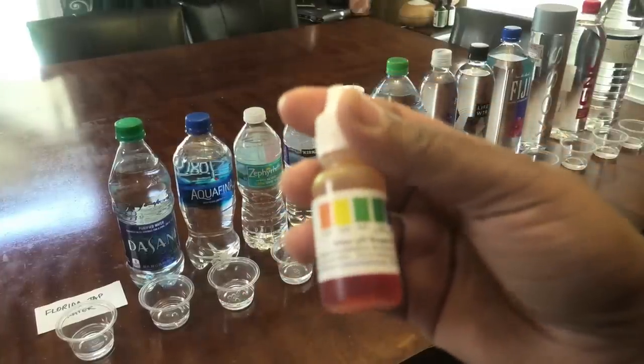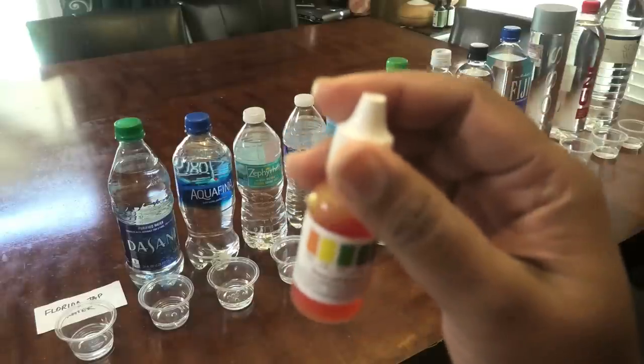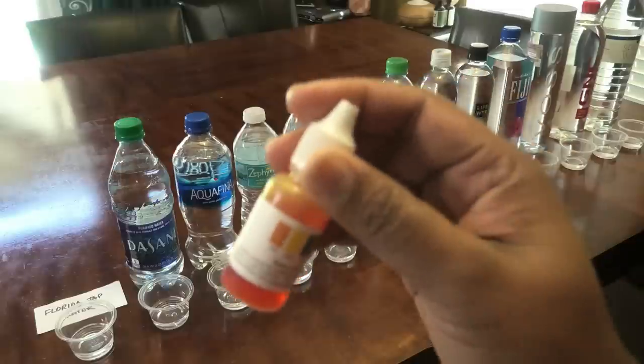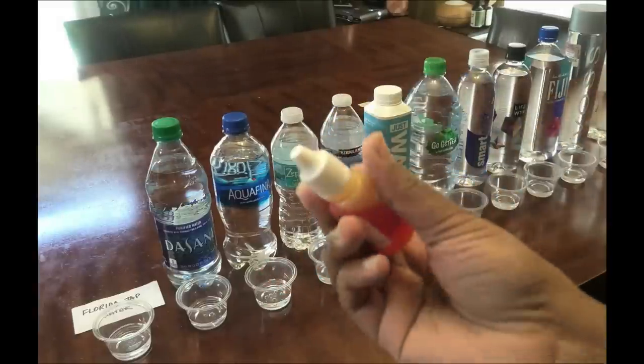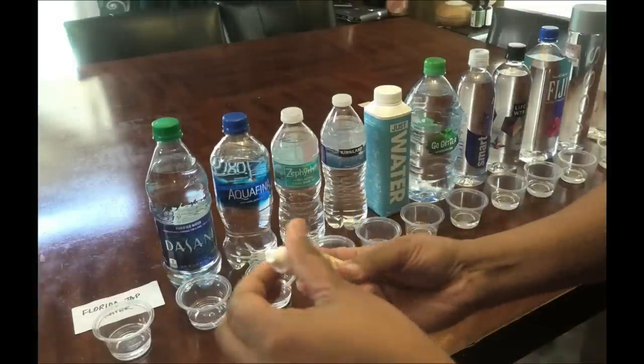Here I have my water pH Reagent liquid. This can test up to a hundred different types of water. All you need is two to three drops in each sample, and you need about two teaspoons of water to test it. So let's start testing — we'll begin with Florida tap water.